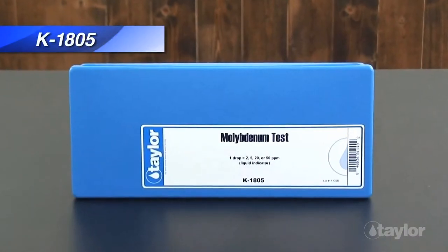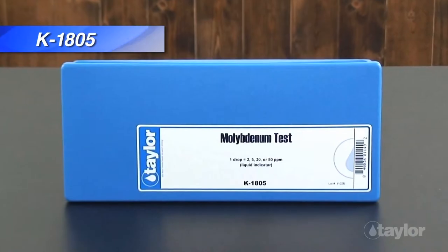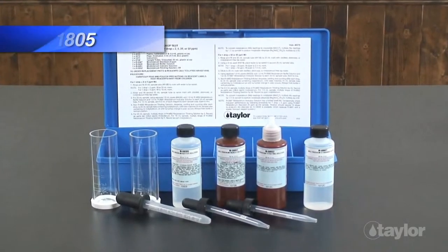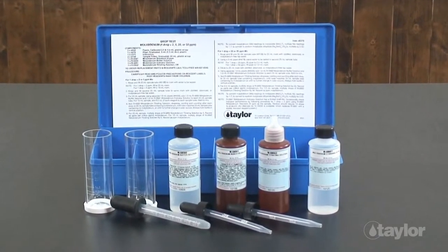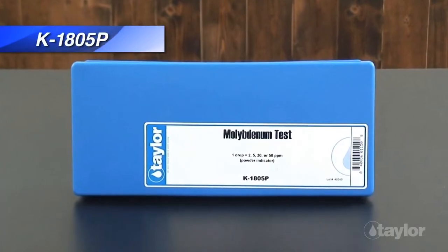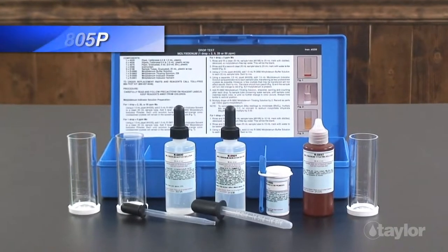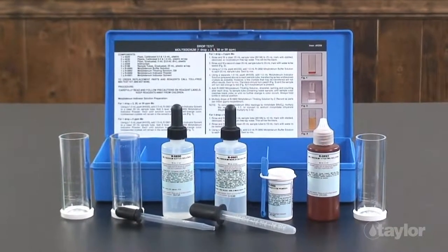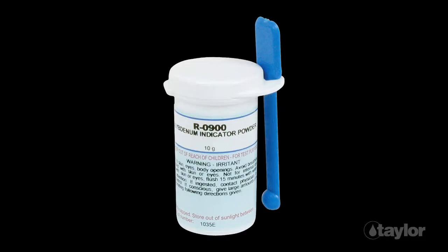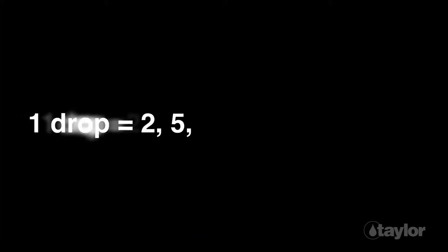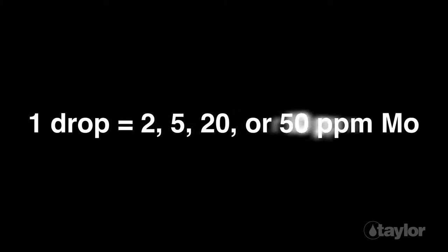Taylor manufactures two drop test kits for determining molybdenum levels: K1805 and K1805P. For this video, we will be demonstrating the K1805P, which includes a powdered indicator for increased stability. The drop equivalency is one drop equals two, five, twenty, or fifty parts per million molybdenum.